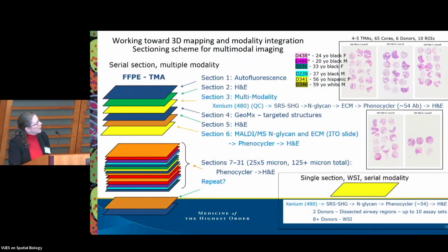Okay, so I was also asked, what are we doing in RTMC to address 3D data production? You've seen some of our true 3D with a multiphoton. We will be moving to light sheet as well, but we have not generated very much of that data yet. And in the meantime, we're working on the serial section 3D data reconstruction.